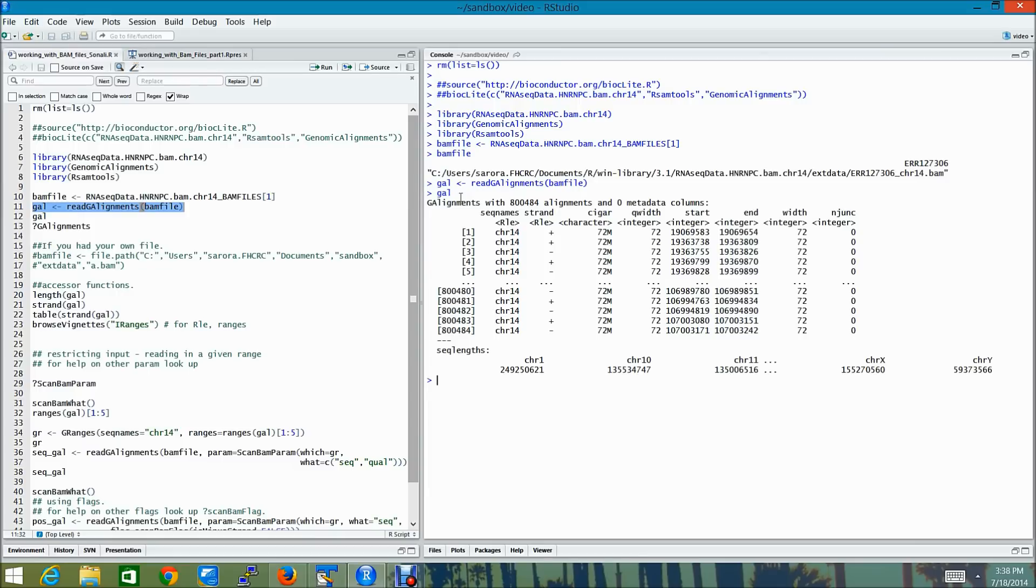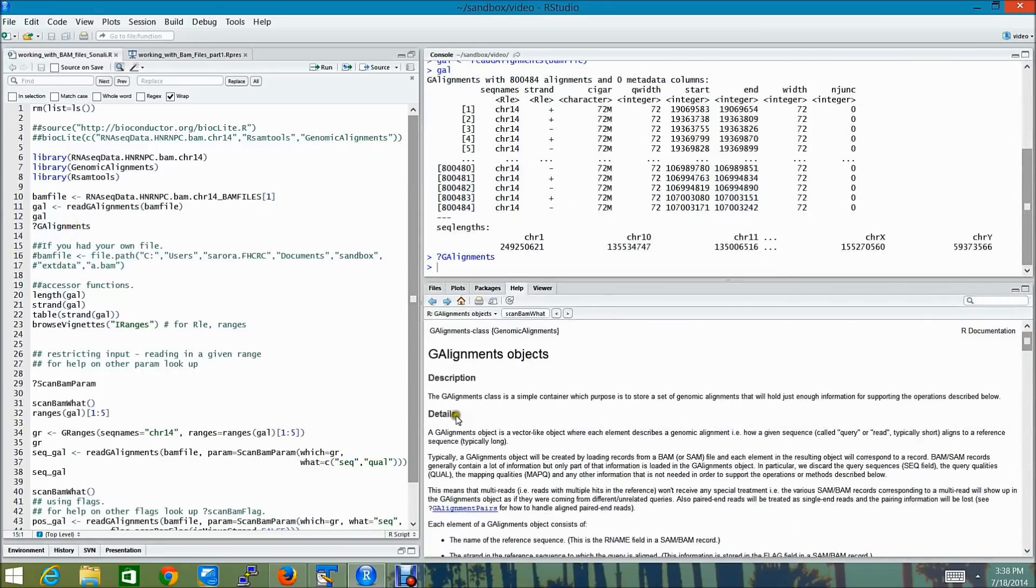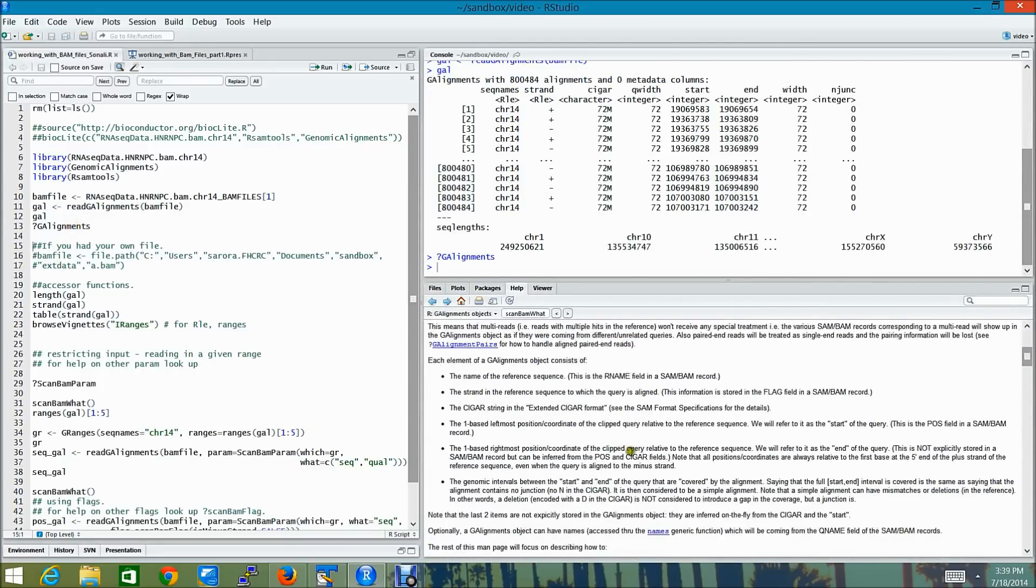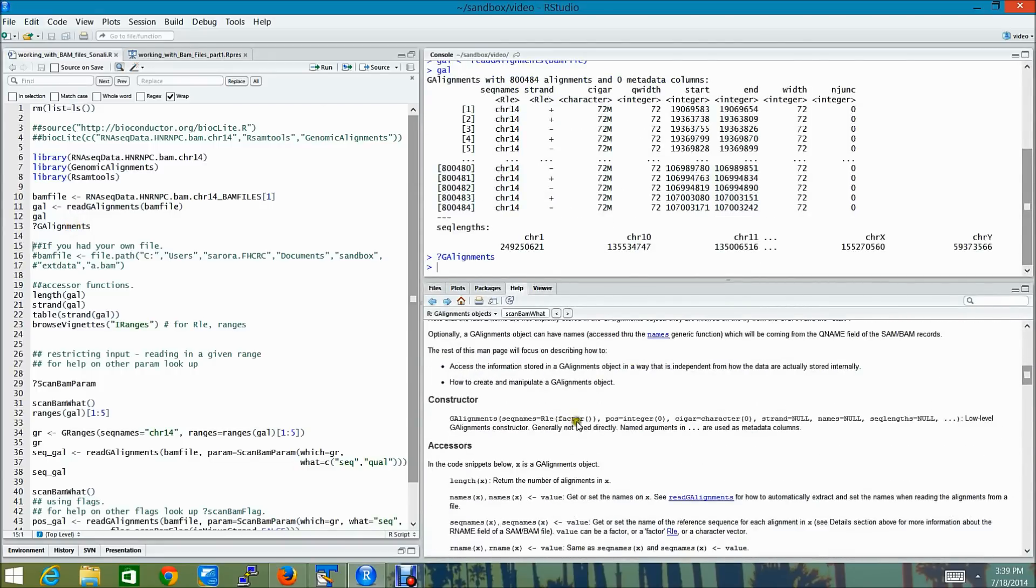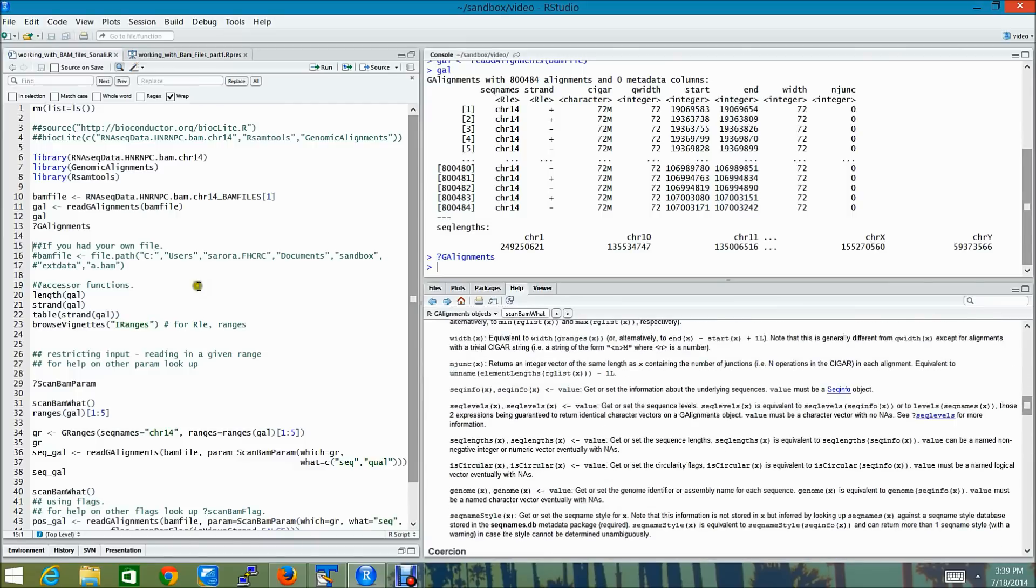And other additional parameters that you can read in if you like. To find out more about this object, let's look up its help page. Here you can scroll through it and read through. There are a couple of examples also found here.